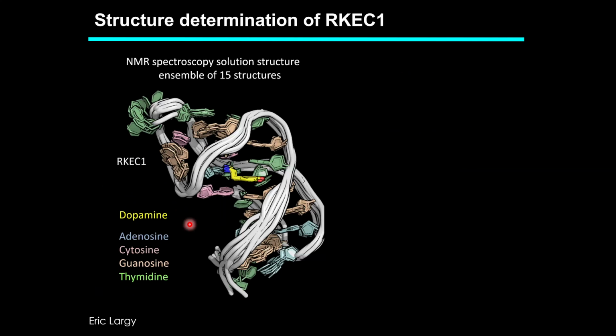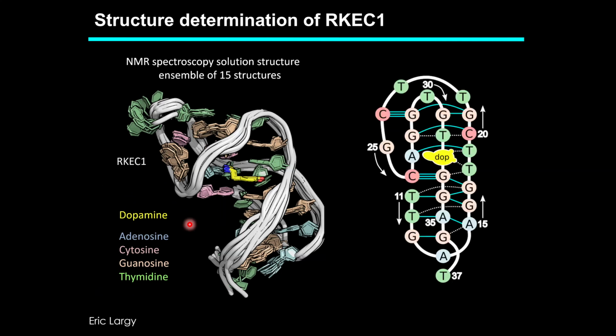And I'm going to jump right to the structure part here. This is the same sequence that I just showed. And there's obviously some sort of folding. I don't know if anyone can see it right away. This looks a little bit like a duplex with a stem loop. But no, I hope if you see this picture now, you realize that it's much more convoluted.